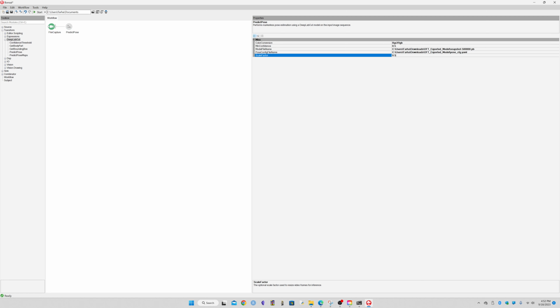So when you're training your DeepLabCut model in the poseconfig file, you have the option of changing the scale factor so that your model gets trained on a lower resolution as well as a higher resolution. And I think the range is 0.5 upward of 1.25 scale. So in my case, nothing lower than 0.5, although I think I have trained my model to be able to handle 0.2 scale, but just for the sake of safety, let's not do less than 0.5.